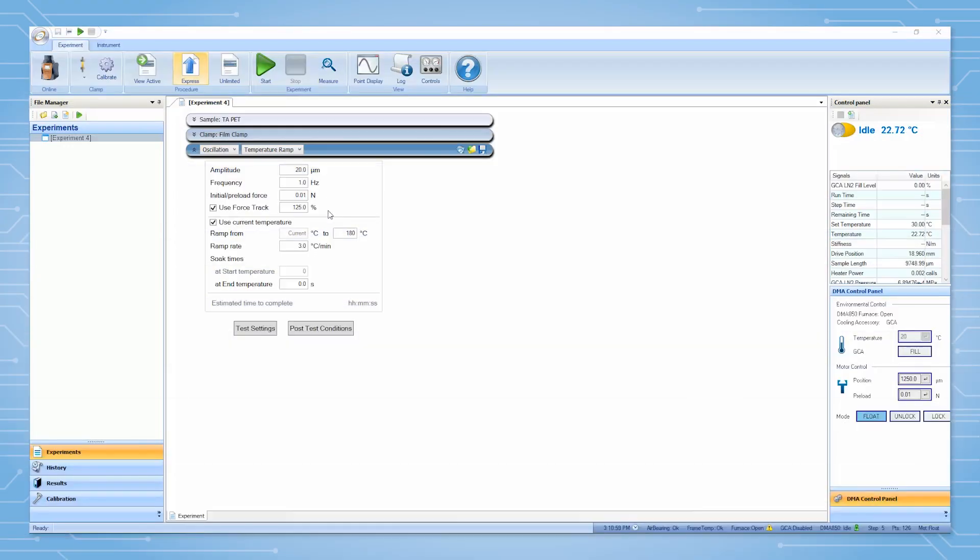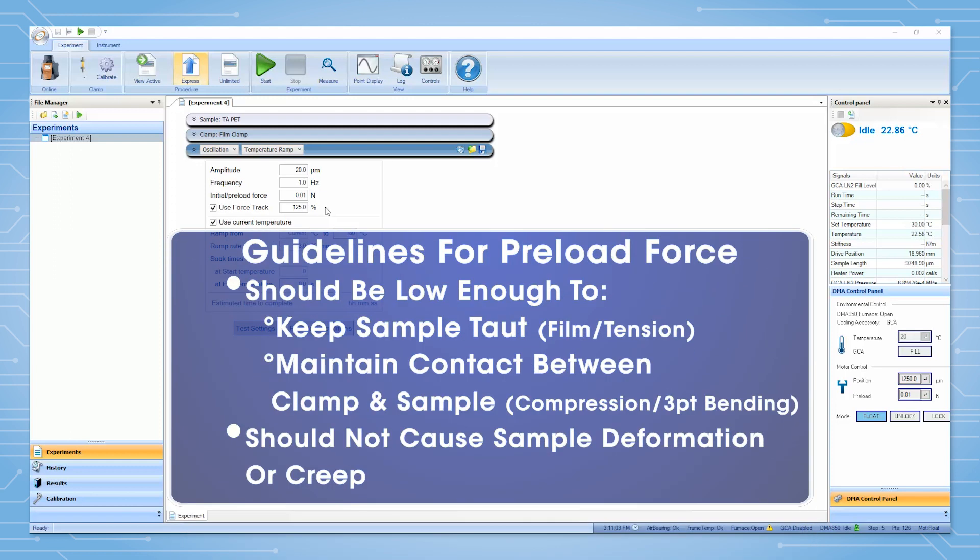A force track of 125% is typical for most samples. Users should choose a force just small enough to keep the sample taut or in contact with the movable clamp, yet not so large that the sample begins to deform or creep due to it.